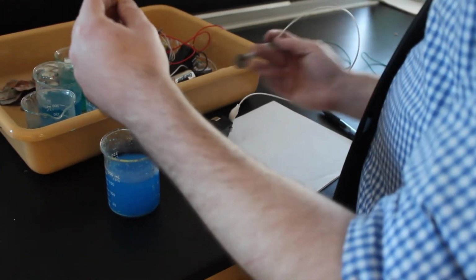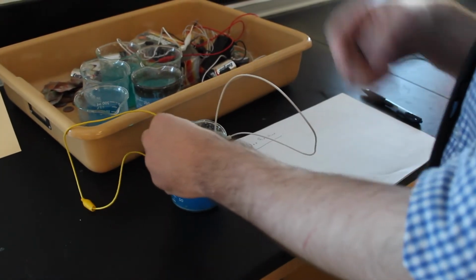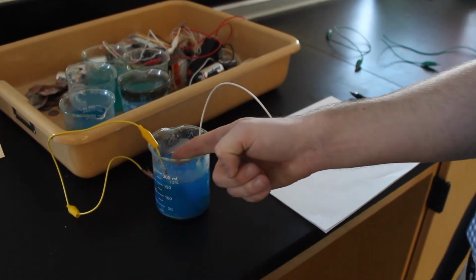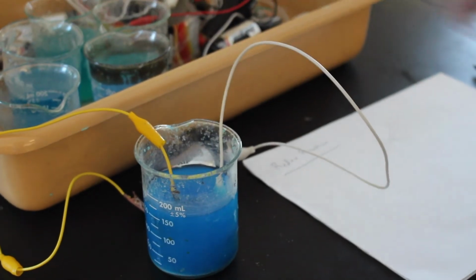Then we put those in an aqueous solution that already has some copper ions inside. That's going to allow the copper ions to flow from the copper metal over to the metal that you want to electroplate.